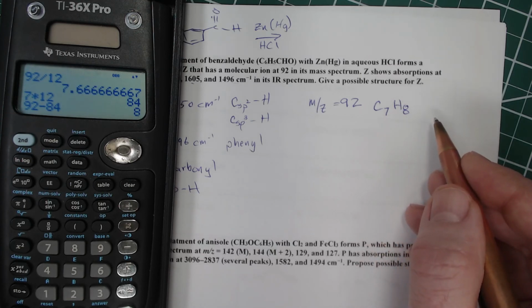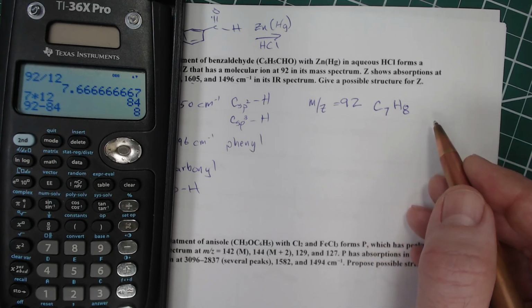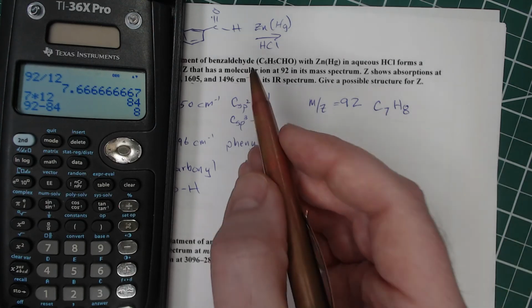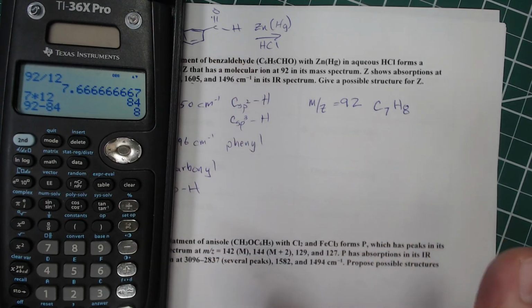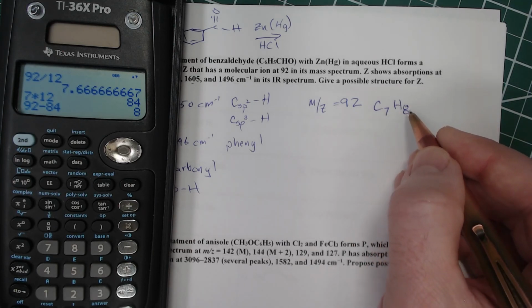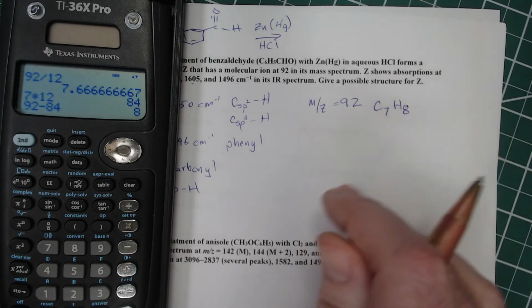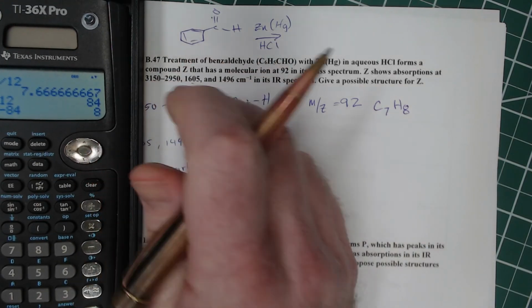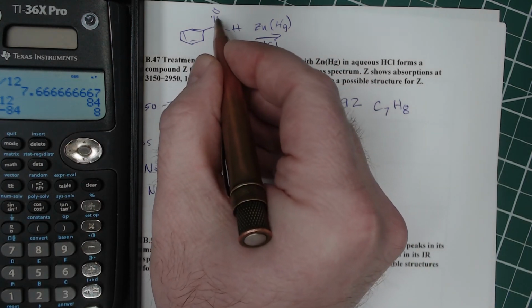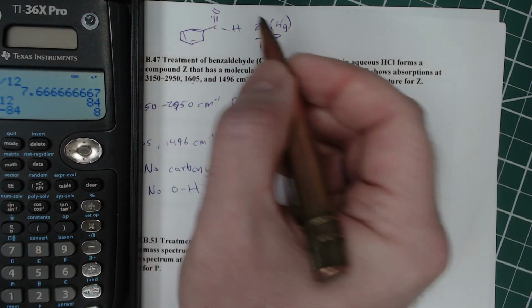All right. Let's see. We don't have any OHs and we don't have any carbonyls. So there's reason to believe maybe the oxygen is gone. So let's look at what this structure could be. Well, one possibility is that when we treated that, we removed the carbon-oxygen double bond and put some hydrogens there.